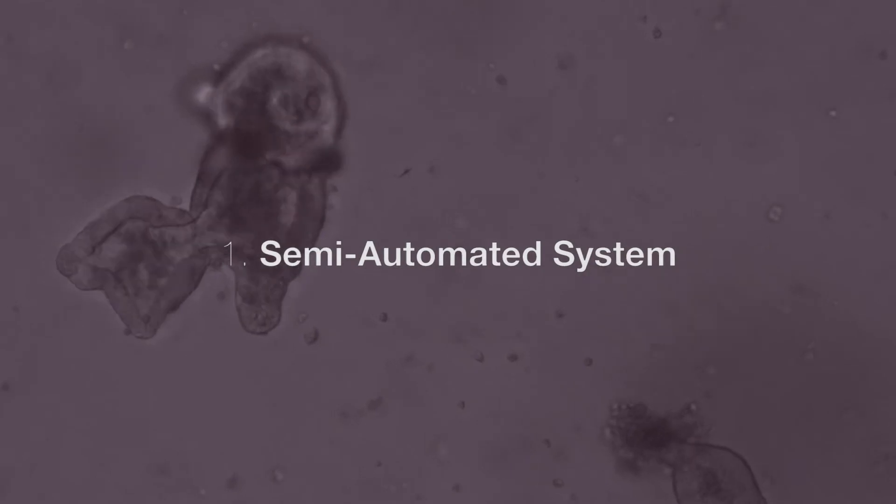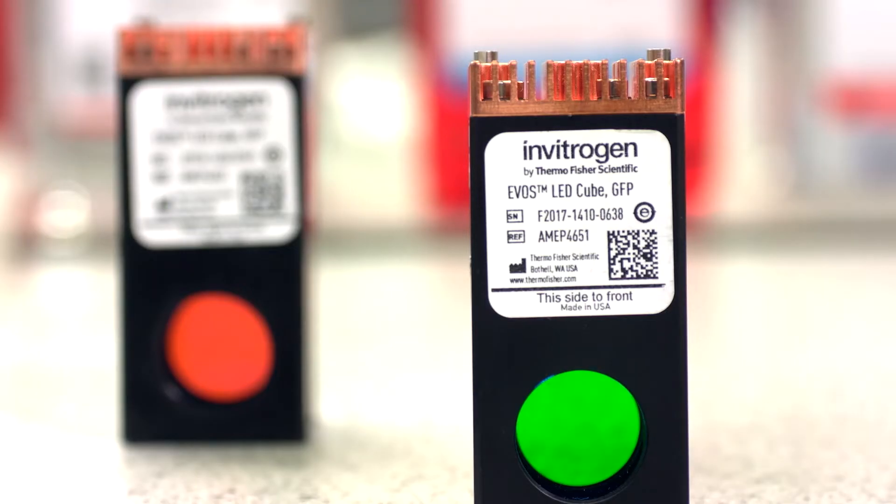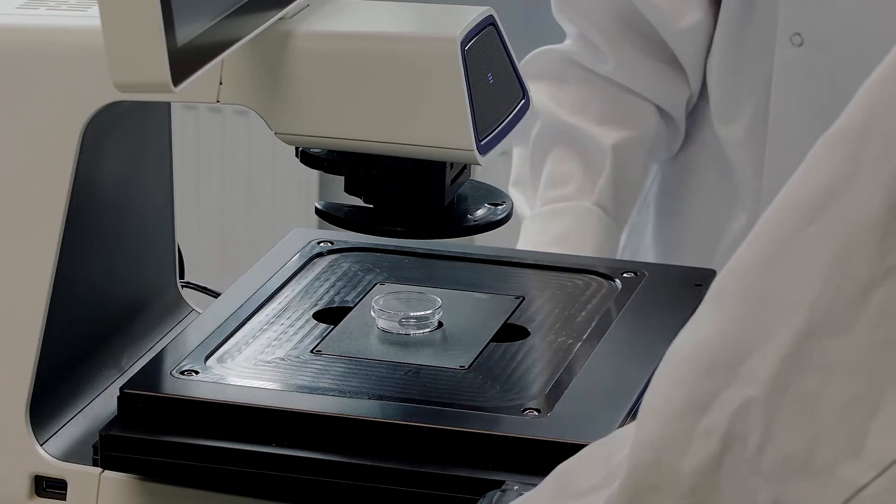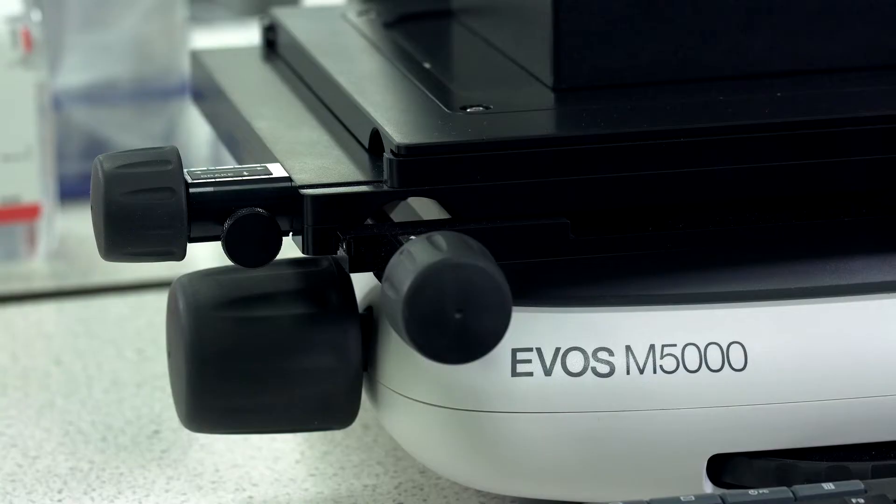It's a semi-automatic system so you can for example choose different filter cubes that you want to have imaged and just press start and it will do the job for you. You don't have to intervene with it anymore which is great because otherwise every time you touch the microscope there's a danger of you moving your cells around.